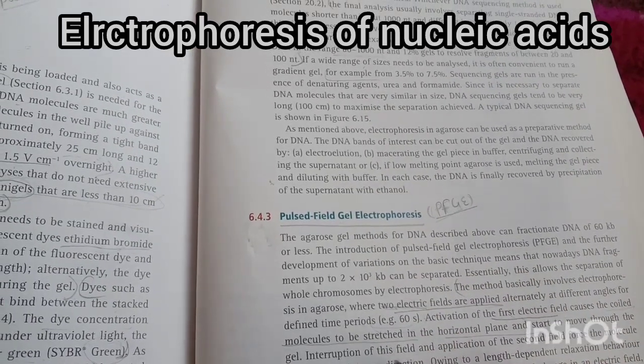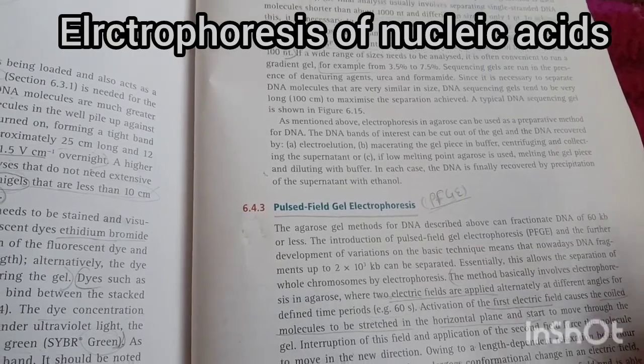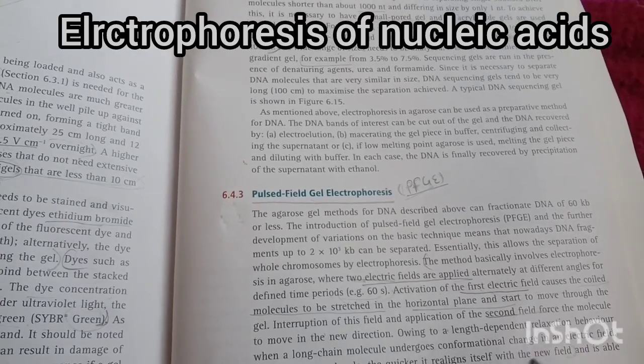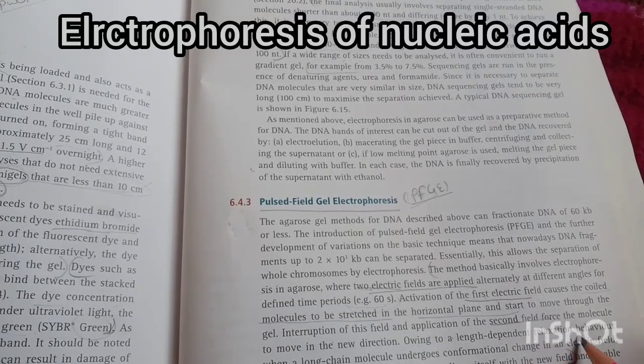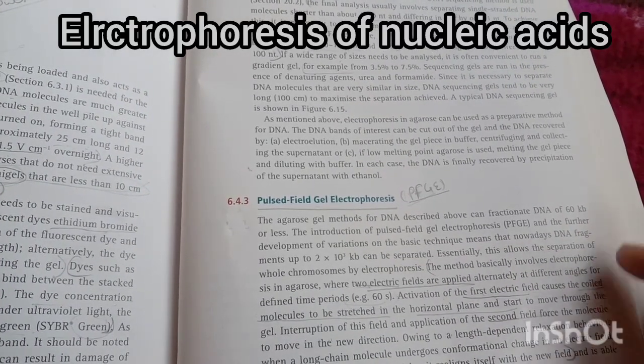Interruption of this field and the application of the second field forces the molecule to move in a new direction, owing to a length dependent relaxation behavior when a long chain molecule undergoes a change in the electric field.